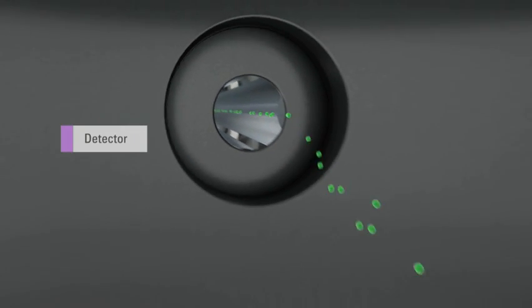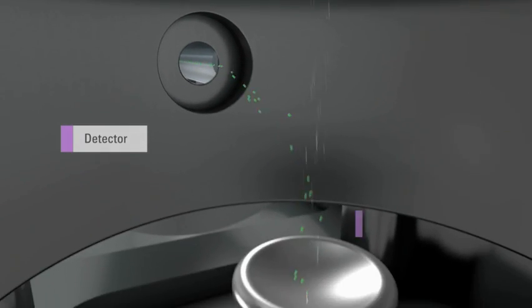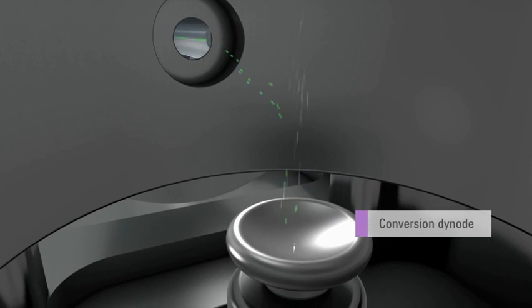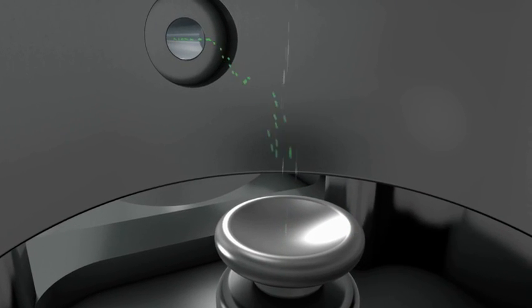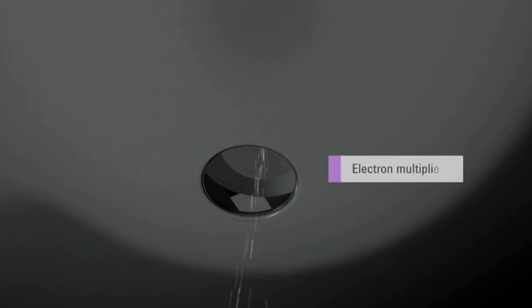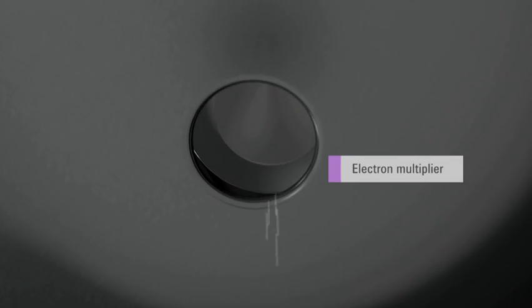Finally, the new detector features a high voltage conversion dynode that enables highly efficient positive and negative ion detection. This design improves signal conversion efficiency while maintaining very low noise.